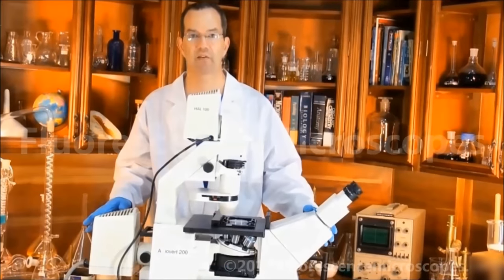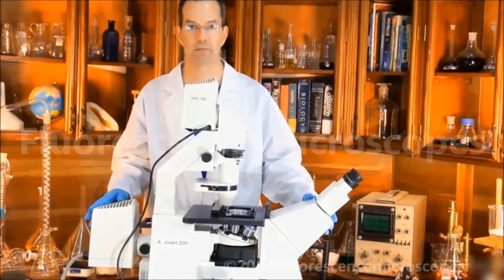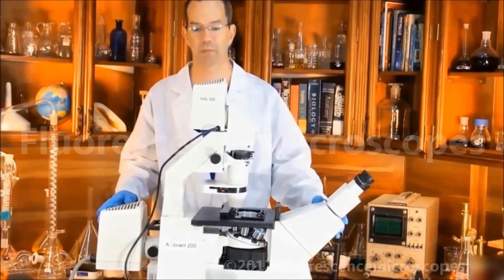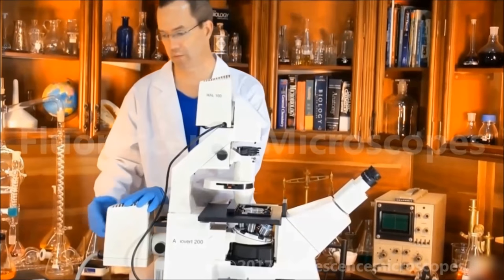This is a Zeiss Axiovert 200 Inverted Fluorescence Microscope. This particular microscope has been configured with an HPO 100 watt system.